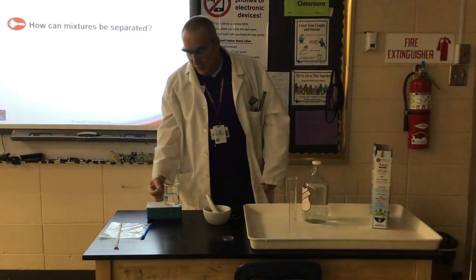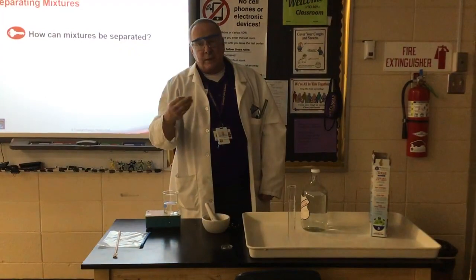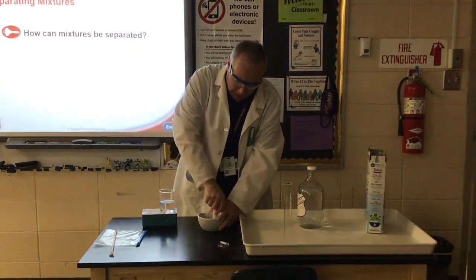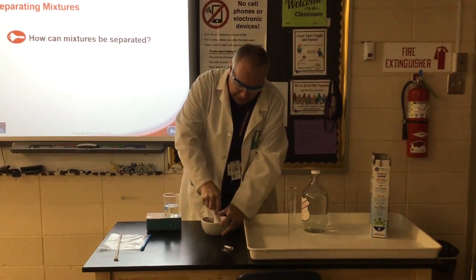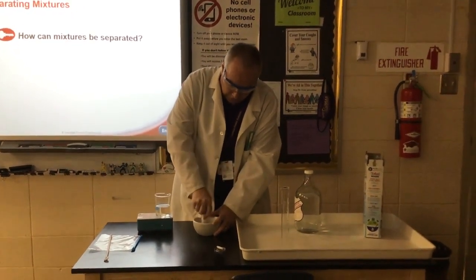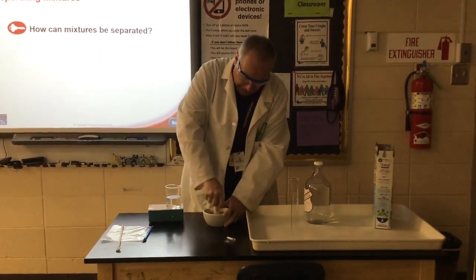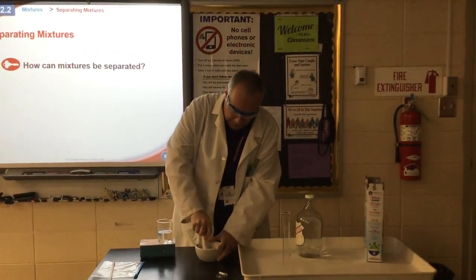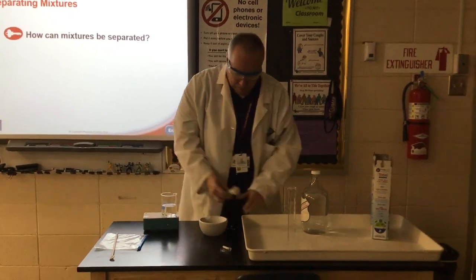And underneath the platform is a motor with a magnet attached that's spinning around, and it causes the magnet to spin and stir. In chemistry, we call this a magnetic stir plate. It stirs things for us so we don't have to. Sounds a little lazy, but if you have to stir for 10 minutes or 20 minutes, this allows you to do it safely and effectively without having to stir continuously, and you can leave your sample behind.